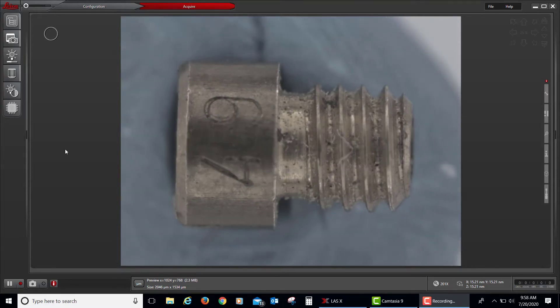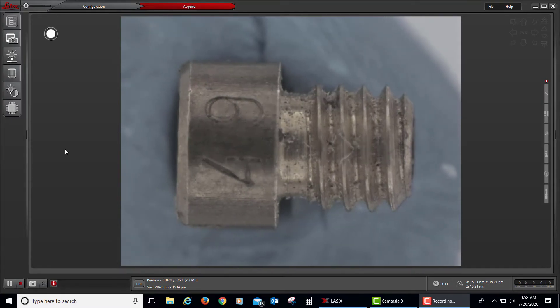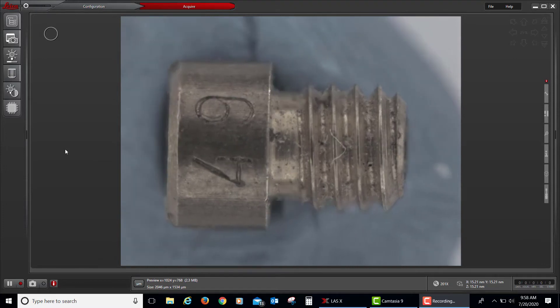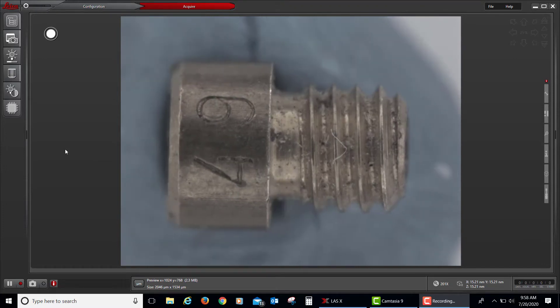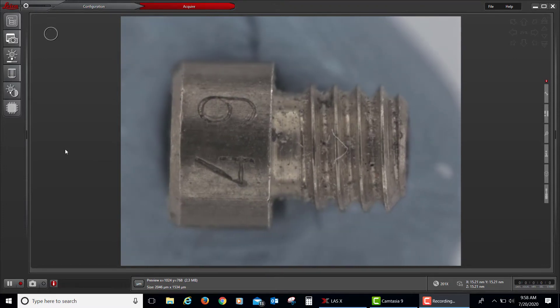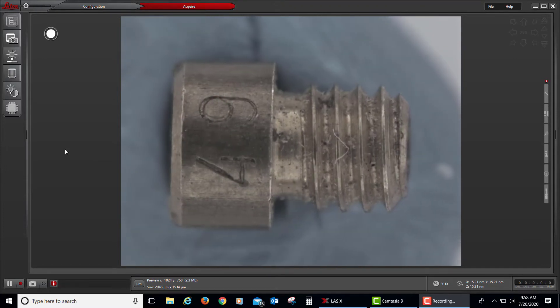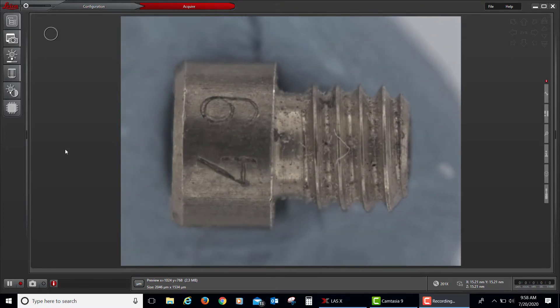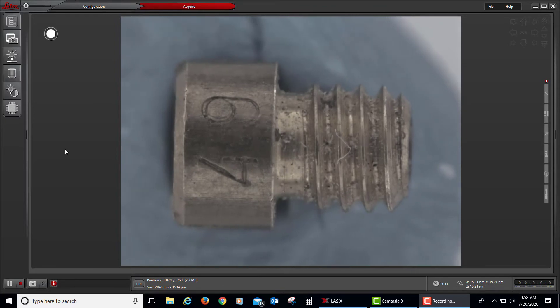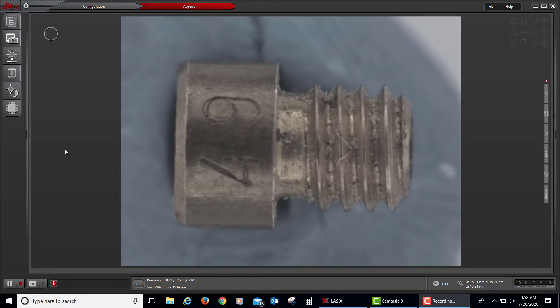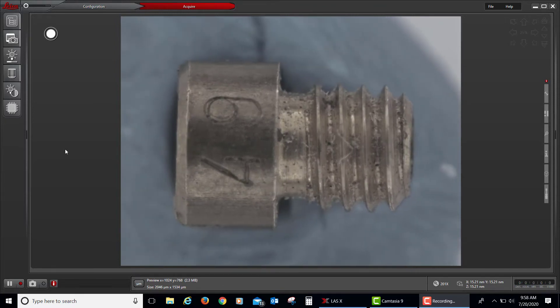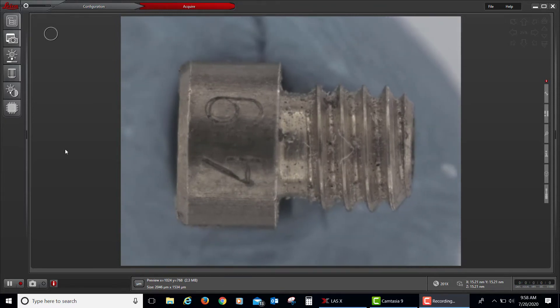Hello and welcome to the Industrial LASX tutorial video series. Today in this short video, we'll be talking about taking a picture and applying a scale bar to our image.